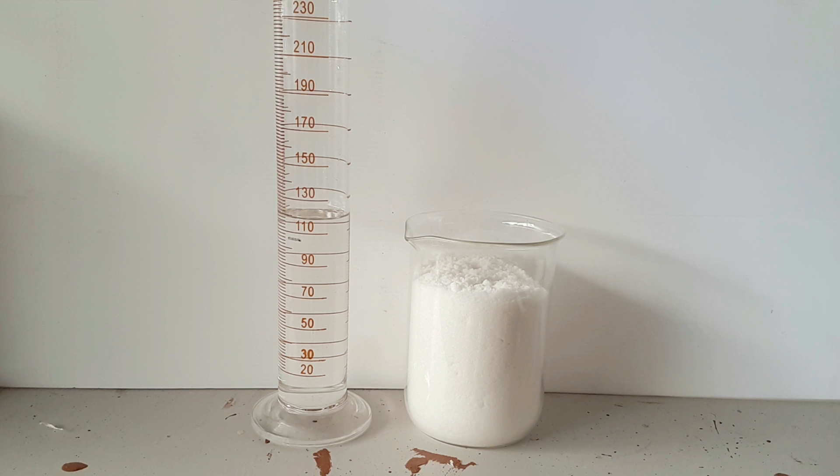Just a note: if you want fuming nitric acid, or at least higher than 68%, you will still need to stick with sulfuric acid.